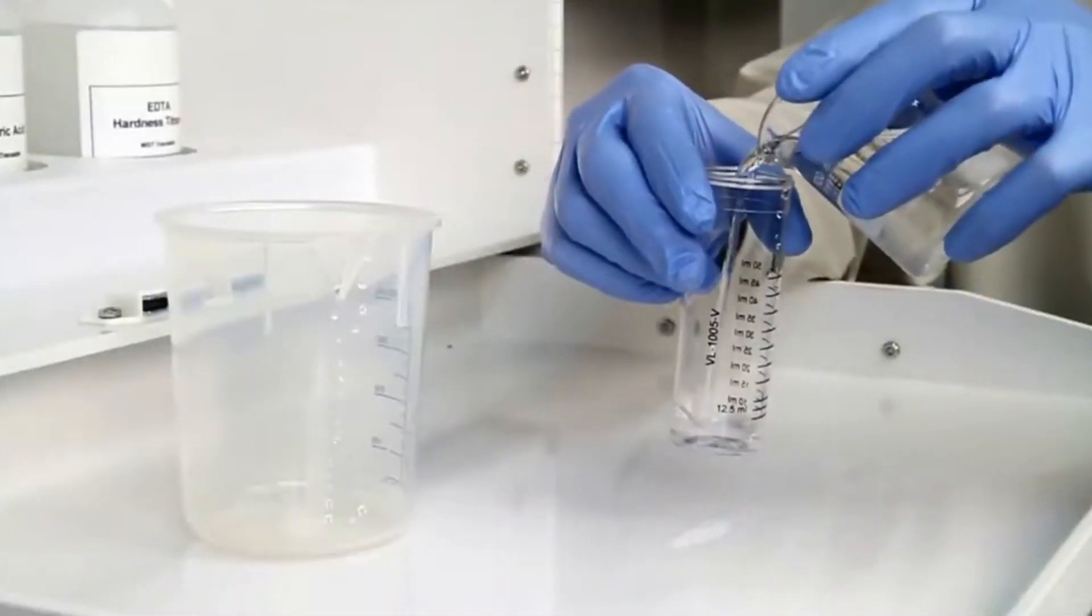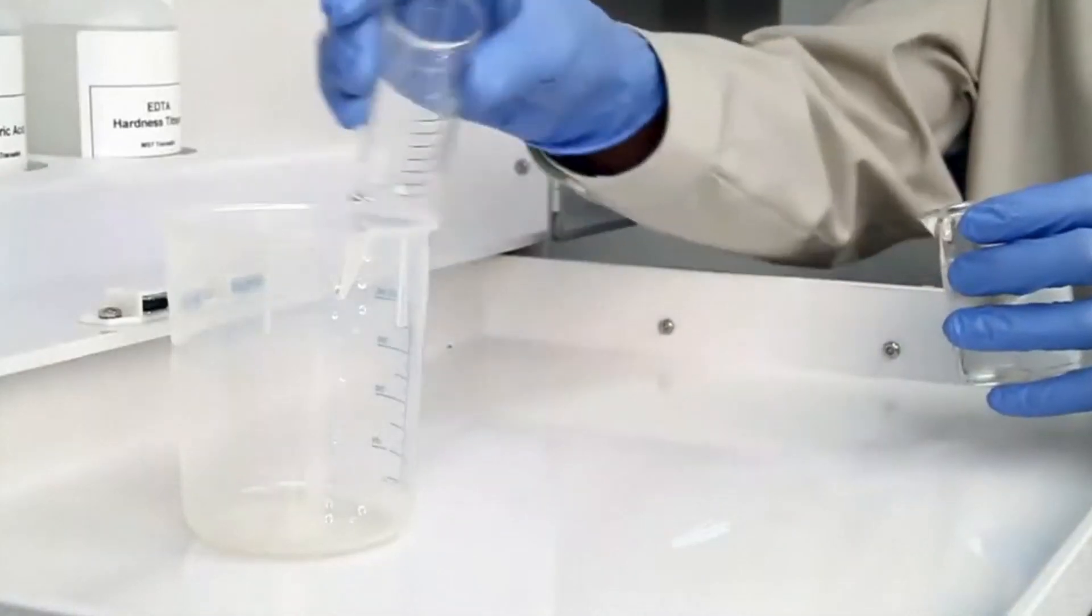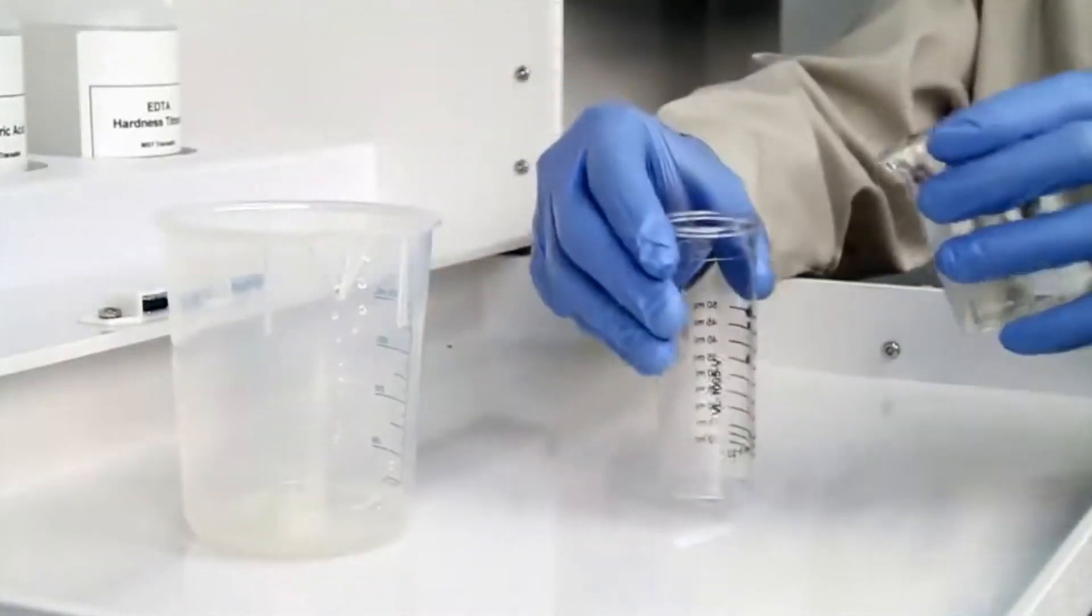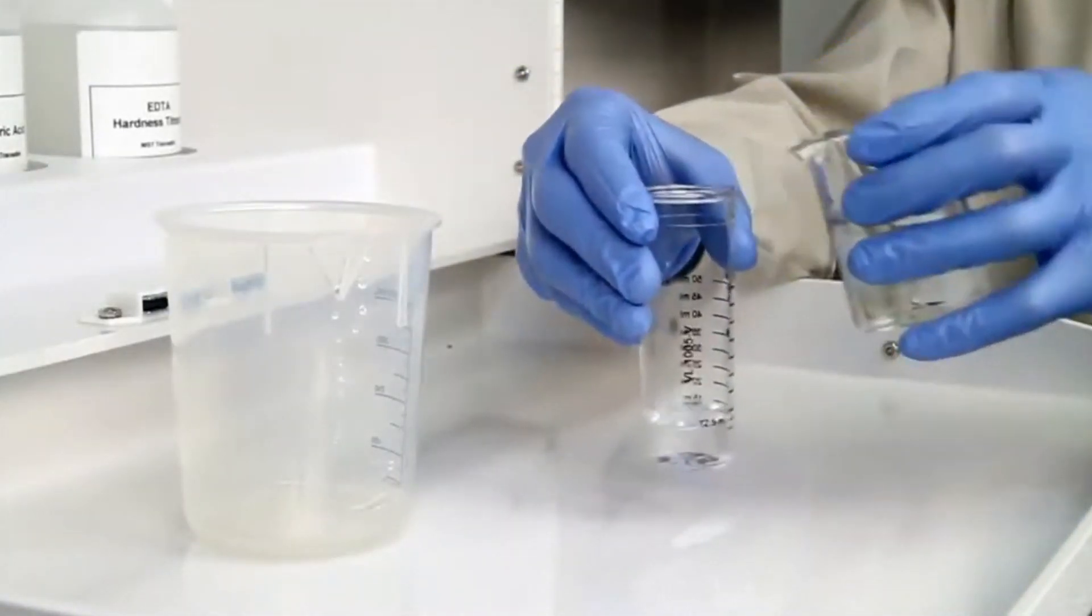The first step according to the EndpointID procedure is to gather an accurate sample. The smallest change in sample size will lead to inaccurate results.